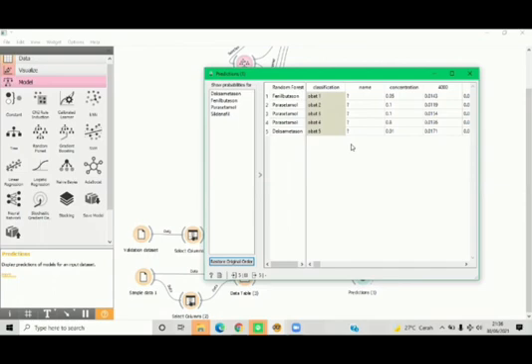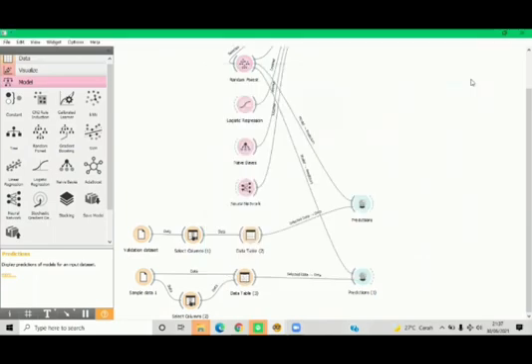When we are done, click the prediction twice and then we can get the sample. We could identify the samples: sample 1 is phenylbutazone, samples 2, 3, and 4 are paracetamol, and the last sample, sample 5, is dexamethasone.